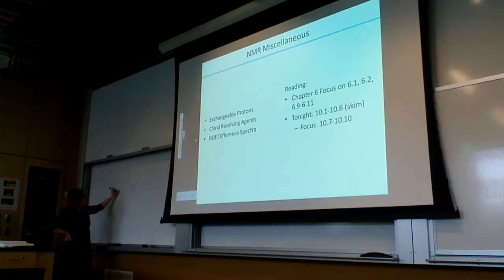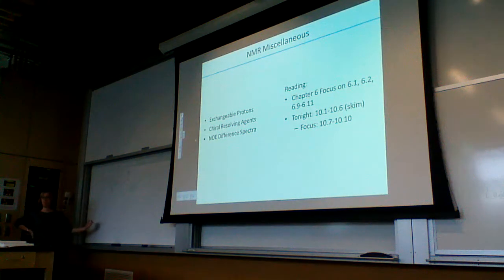But there's another hydrogen over here. And this hydrogen is going to split it maybe at a different value. And so when we drew that out, we would get a different... it's not going to look just like a triplet anymore. It's going to look a little bit different.